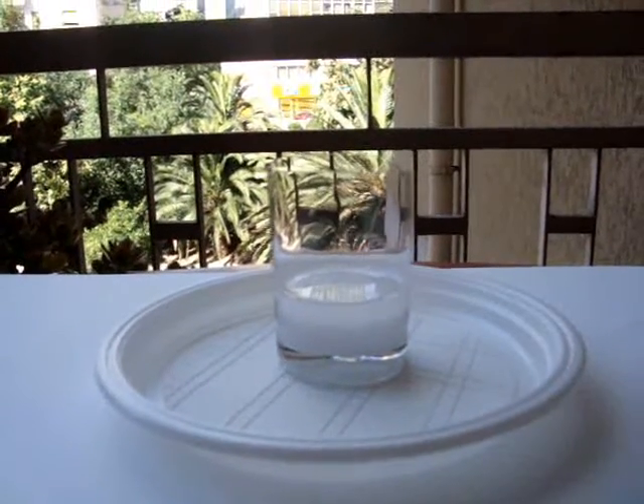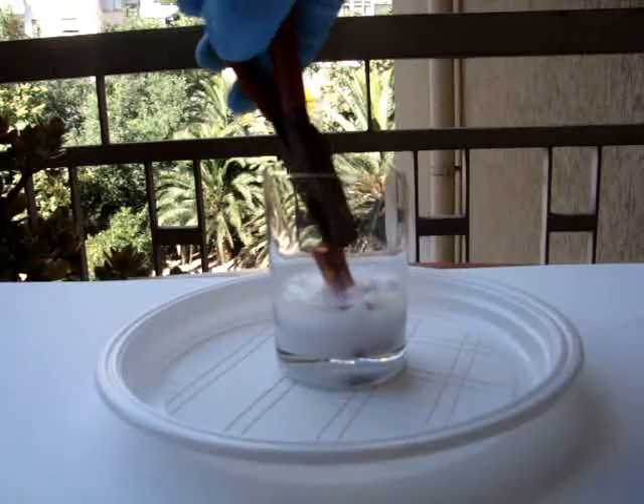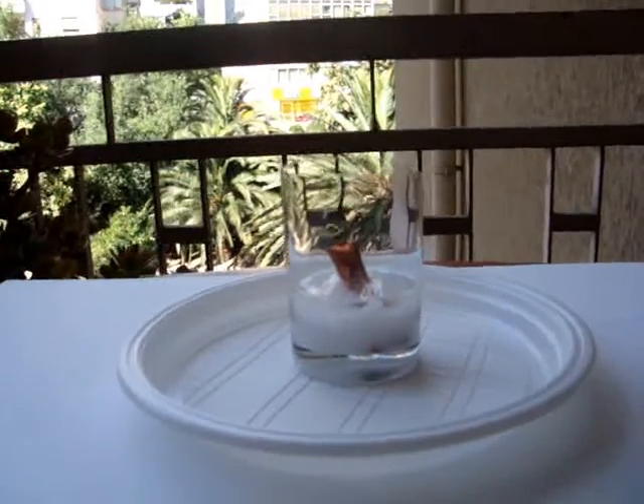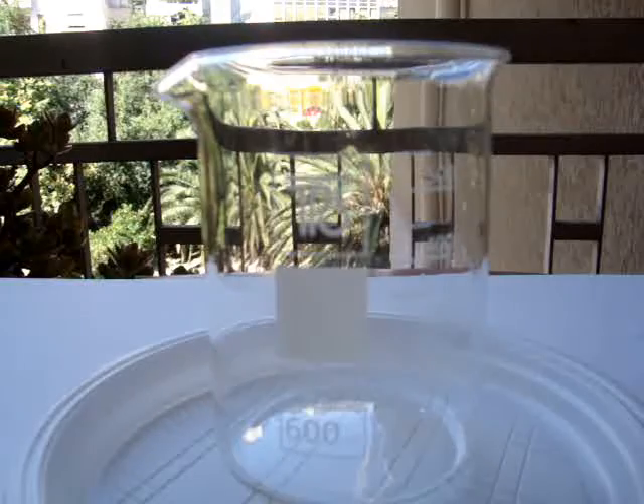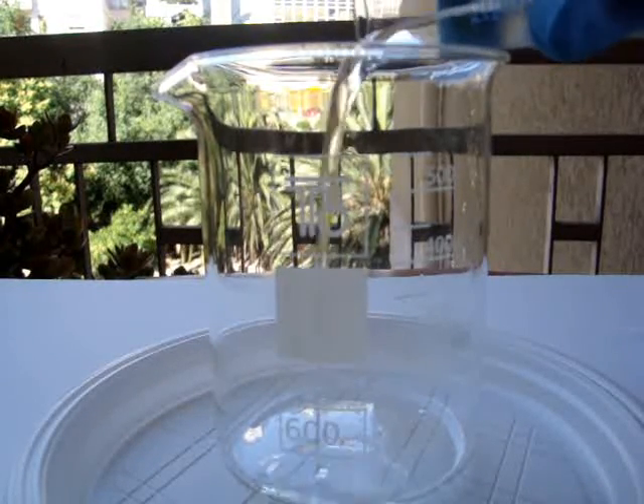Then add about 15 grams of copper or more. Now take a larger container and fill it with 25 mL of weak and cold hydrogen peroxide.